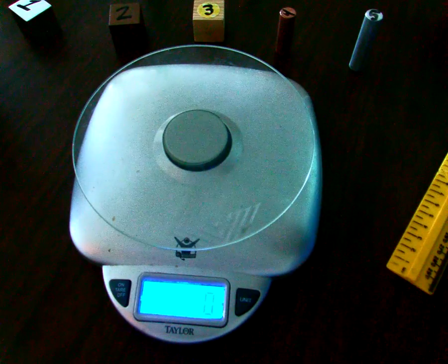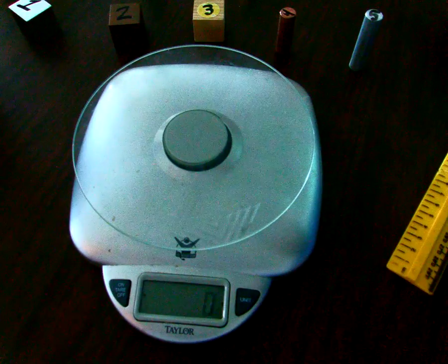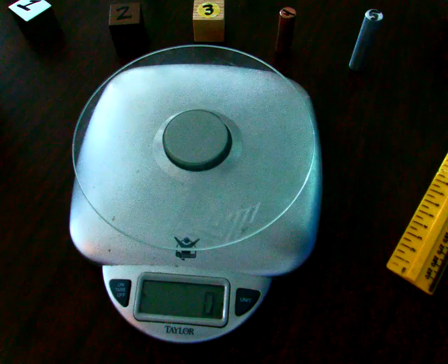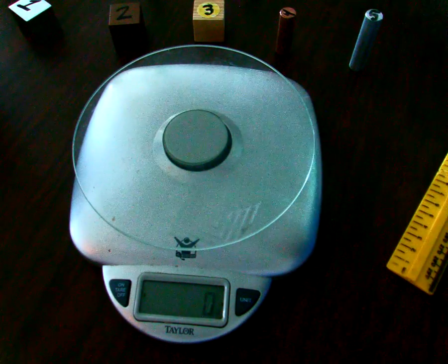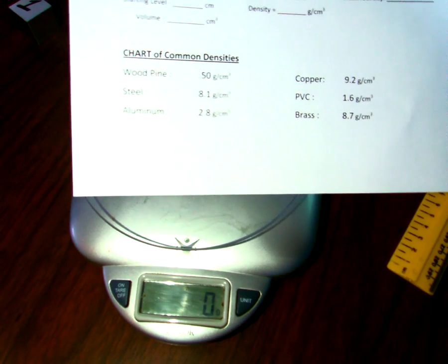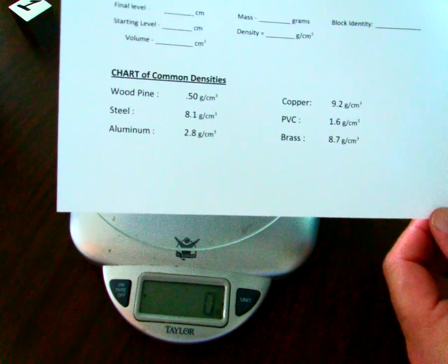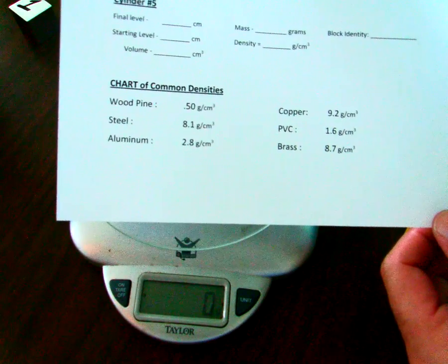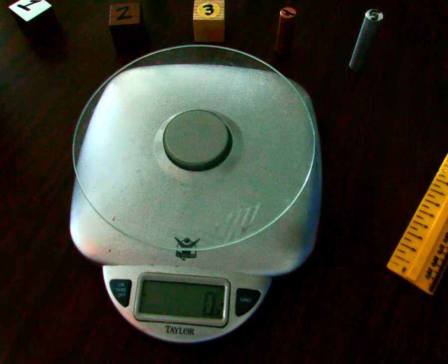So now you have your volume for block 1. You have your mass for block 1. Take a second to calculate your density, and go ahead and put that in your answer document. And then if you would, take a second and look down at the bottom at the chart of common densities between objects. I'll turn this light back on. You can see a little better. Well, it looks like you can probably see just as good when it's off. So take a look at that chart of common densities and see if you can figure out what is block 1. What element is block 1? What material?